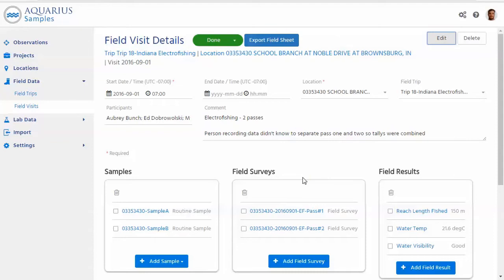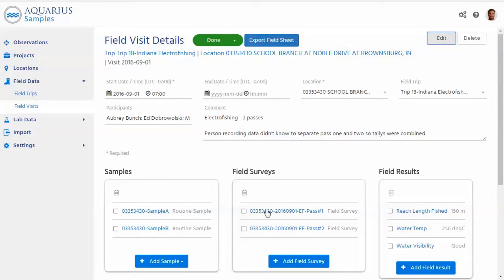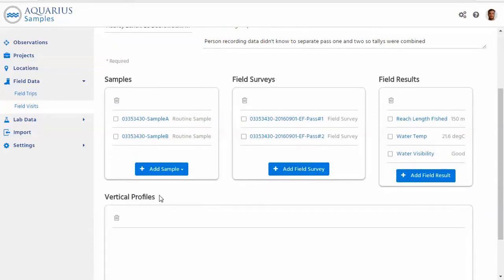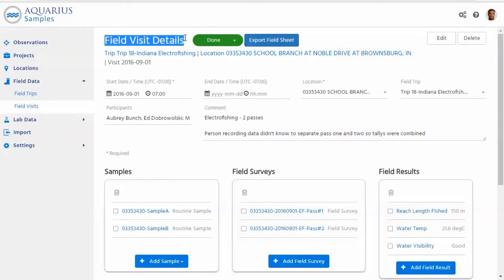Right before I do that, as you mentioned there is different data types within this visit. I think it's important to point out what ties those different data types together in this visit. That's the system doing that for you. You don't have to match up data by IDs, by daytimes, by locations. This data is part of this visit so you could be doing sampling field work with different time stamps or you could be doing field surveys, field results and even vertical profiles. All that data is part of this visit and that's really a concept that's built into Aquarius Samples. So it really helps if later on you're trying to dig into different types of data and what was going on in the field at that specific time.